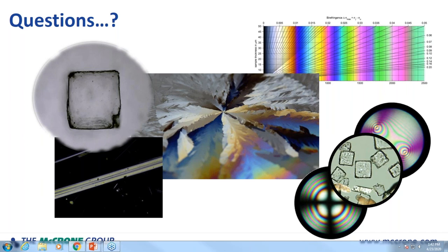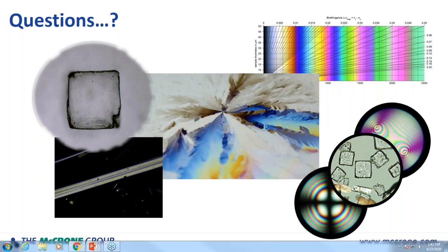Tom's asking if you have a fixed stage, can you also rotate the specimen? Yes, you can. You can rotate the specimen, but keep in mind that the rotating stage is centered relative to the axes of the objectives. So if you're not rotating the particle you're looking at within that same axis and it processes outside your field of view, that's not going to do you any good. There are ways around that. I've seen people make little turntables, perhaps using small ball bearing rings. But all those present their own problems because I still have to be able to transmit my light through whatever I have my slide set on. So if you're going to get involved in this heavily, you would eliminate a lot of frustration for yourself if you get yourself set up with a rotating stage.